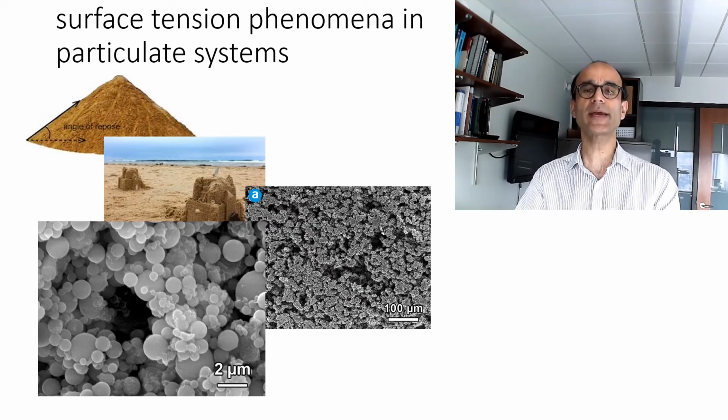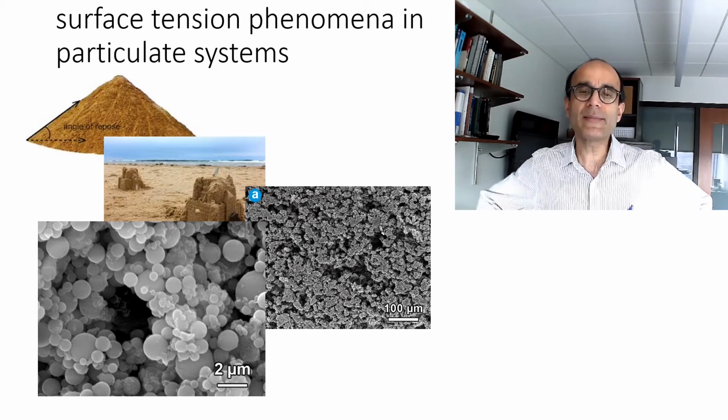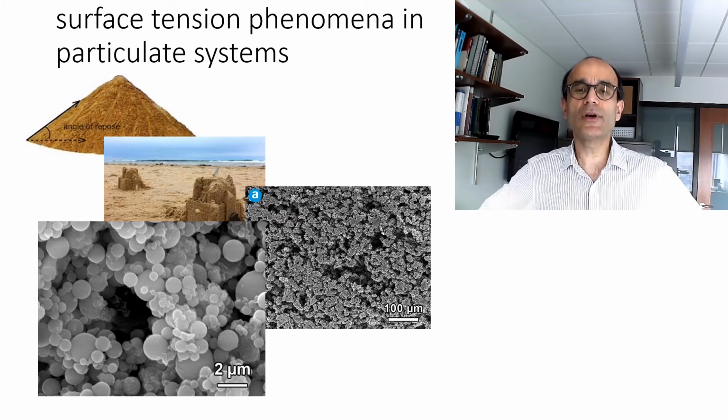We just mixed together two liquid species and one particulate species. And after mixing, we dissolved out one of the liquids. So what remains is a porous structure. And if you look closely, you can see small fluid menisci that are still holding the particles together.